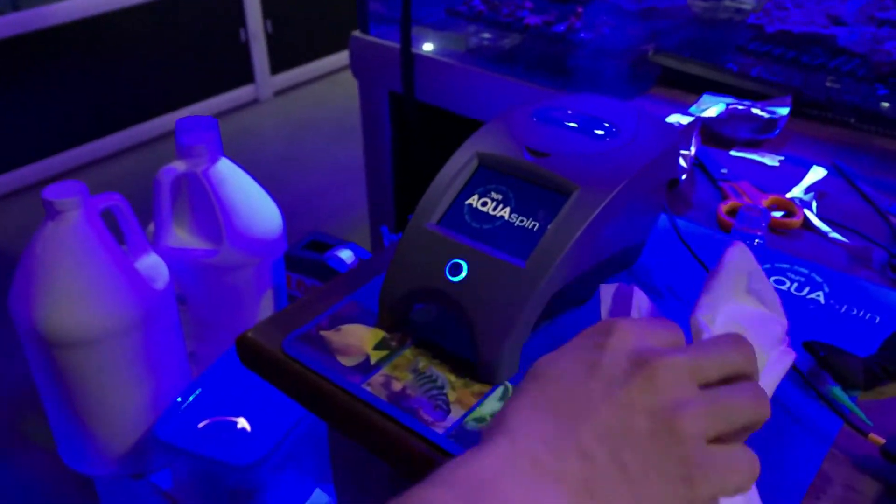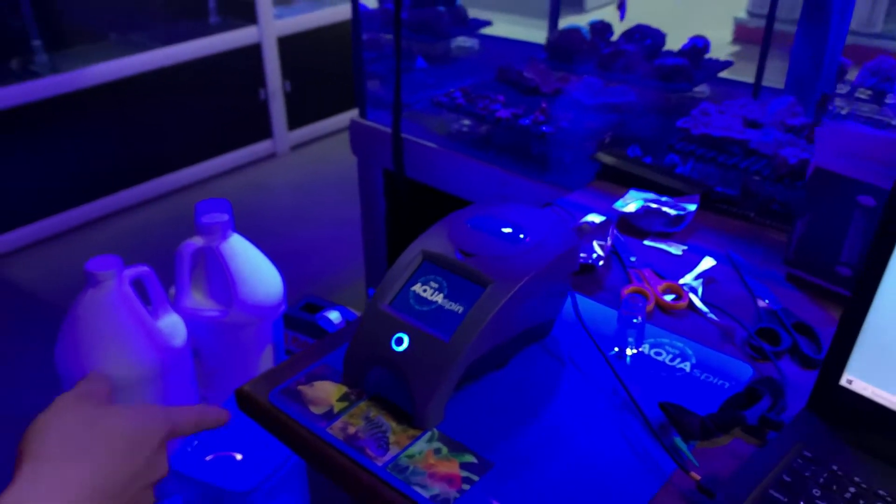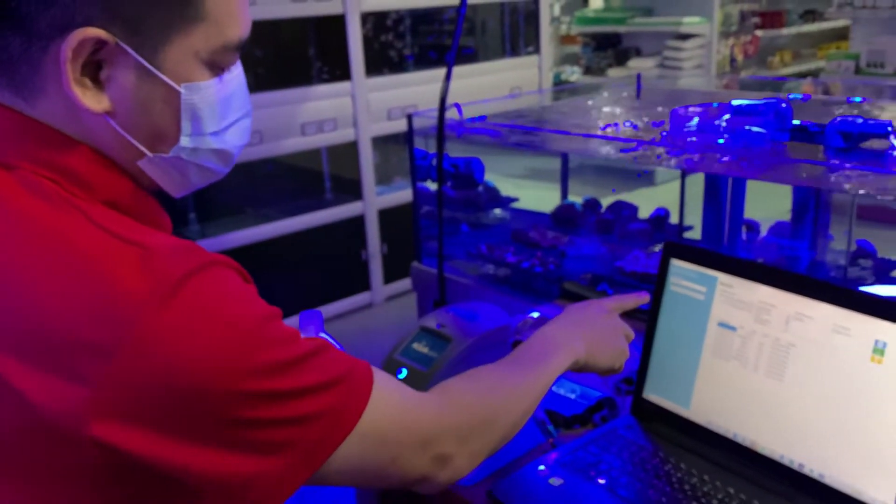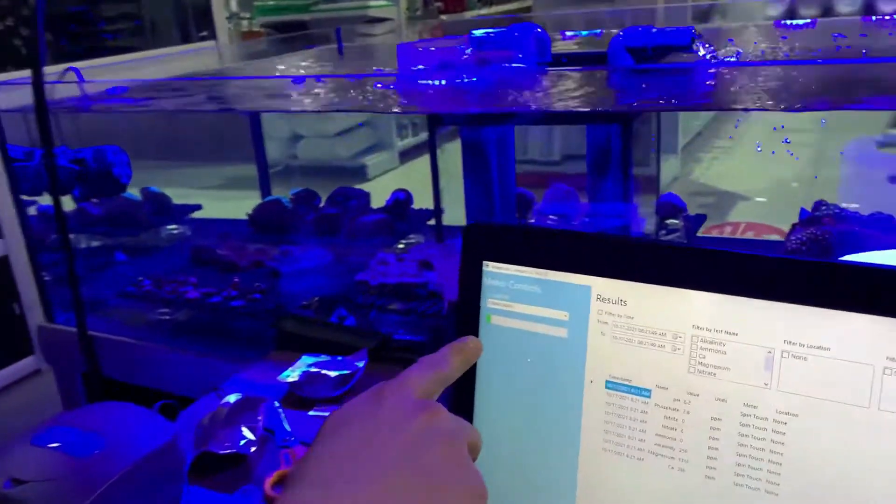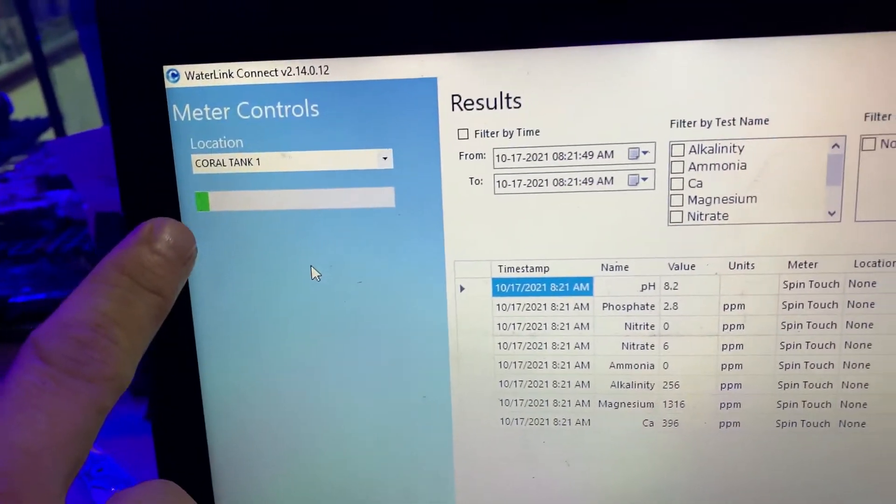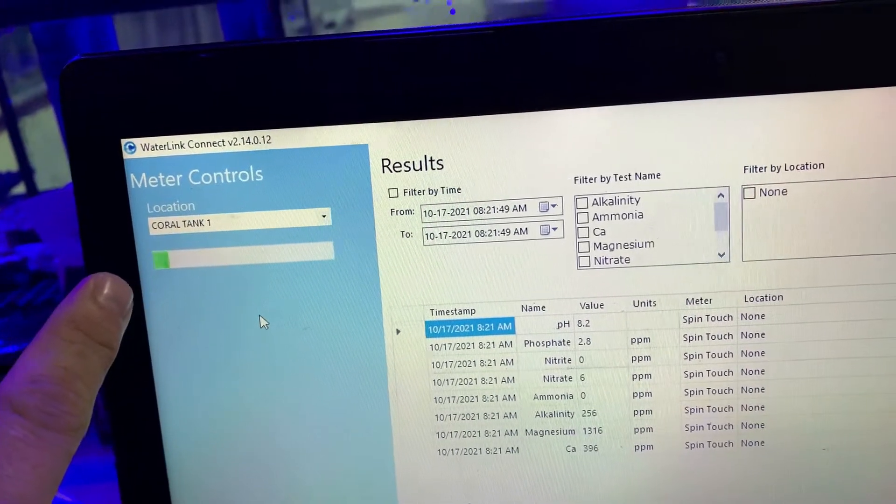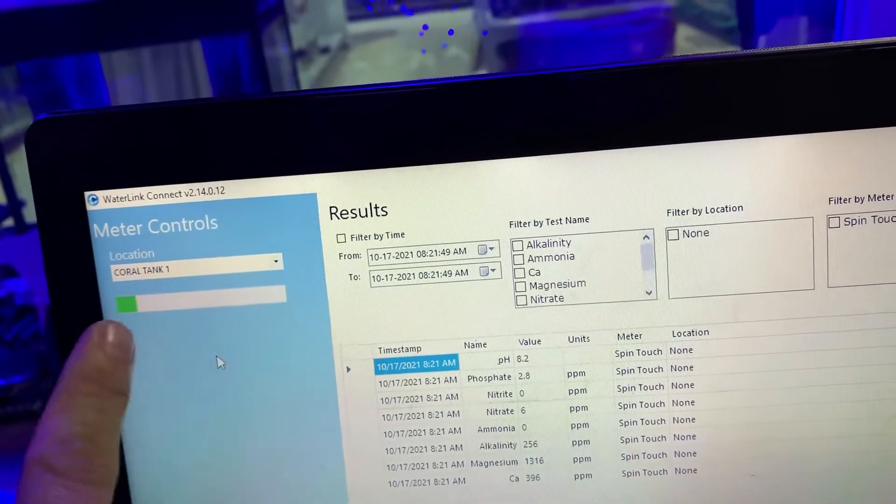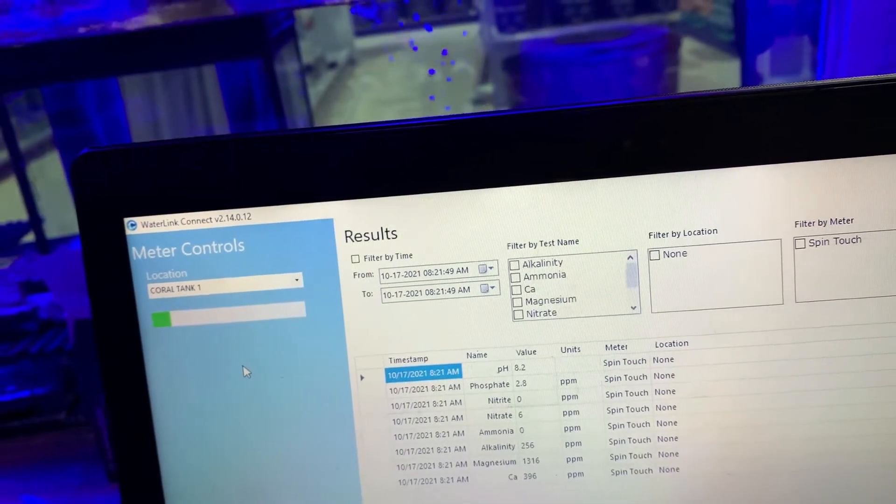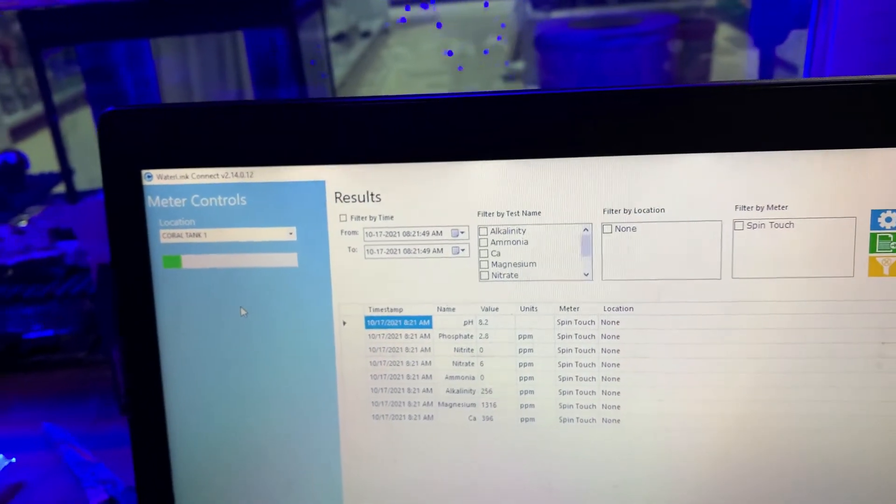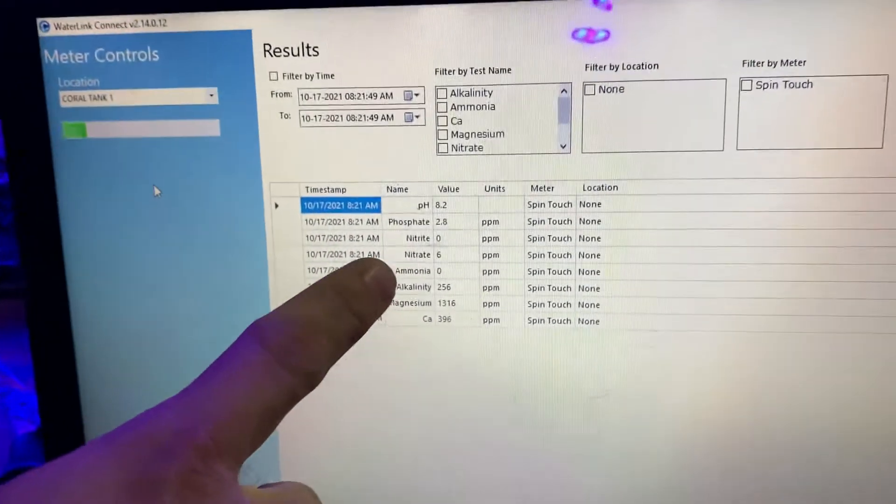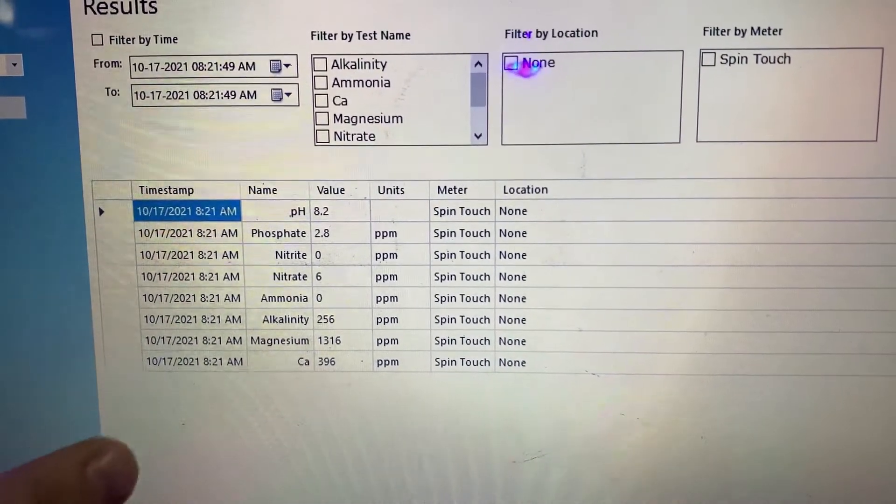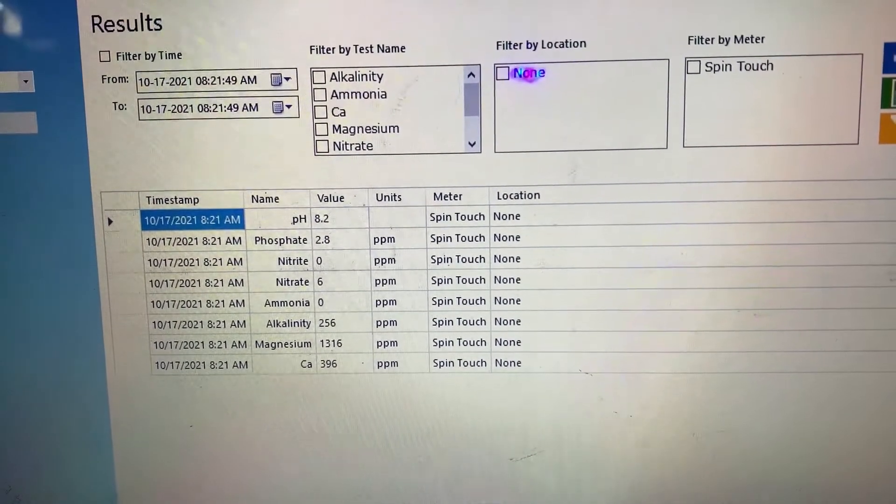It will start to blink. That means it's spinning now. As what you can see, this is the indicator. If this green color will fully fill this white area here, means it's finished testing the water. As what you can see, this is our previous test in the other tank. This is how it shows. This is how it's supposed to be presented.